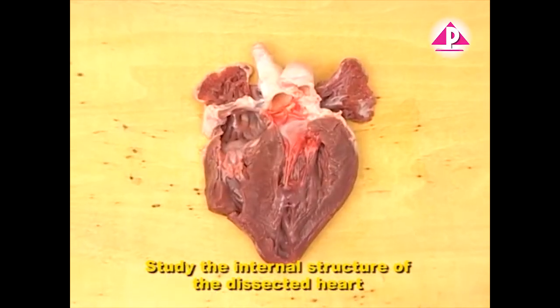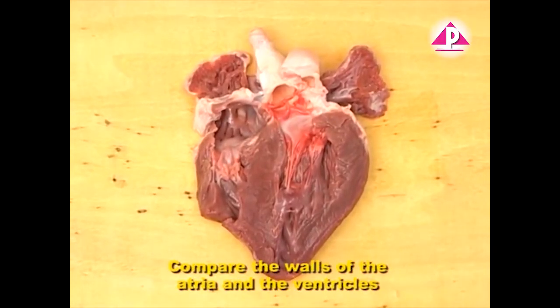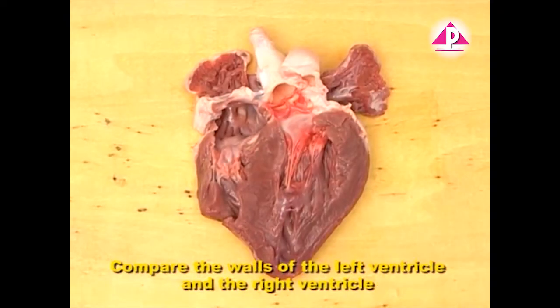Study the internal structure of the dissected heart. Compare the walls of the atria and the ventricles. Compare the walls of the left ventricle and the right ventricle.